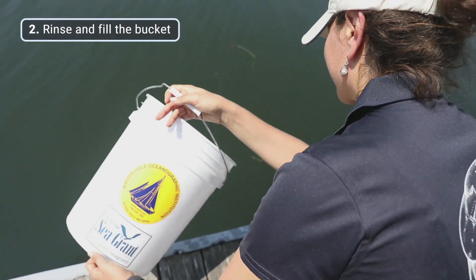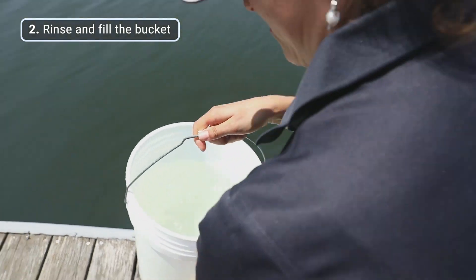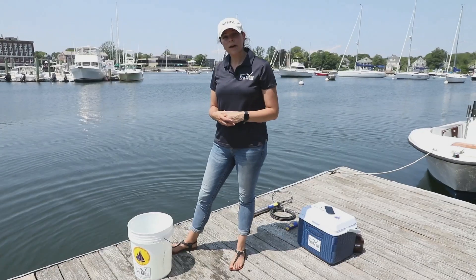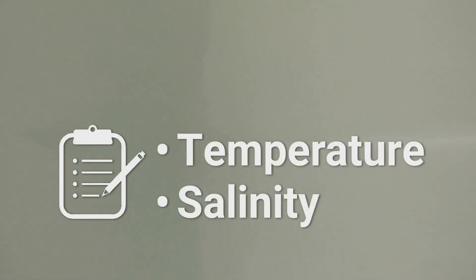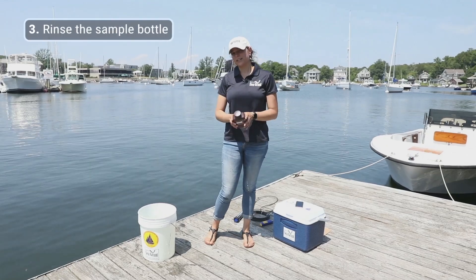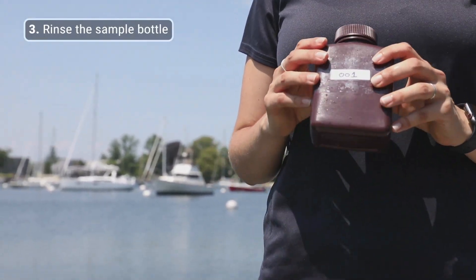Once your bucket is rinsed, we're going to fill the bucket and that will be your water sample for Shell Day. If you're using another method for measuring temperature and salinity, you should collect that measurement from the bucket now. To collect our water sample, we're going to take our pre-labeled bottle and rinse it three times.